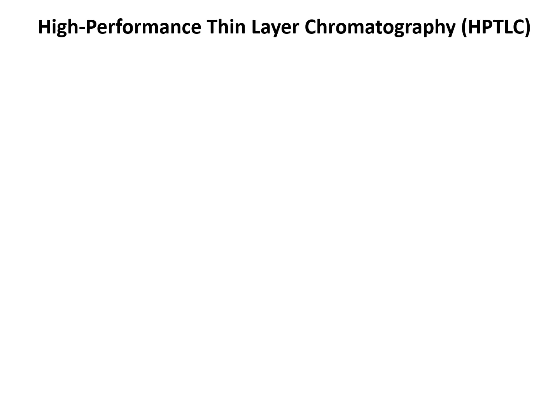It is the same as conventional thin layer chromatography, only that everything in high performance thin layer chromatography is aided by automated devices.